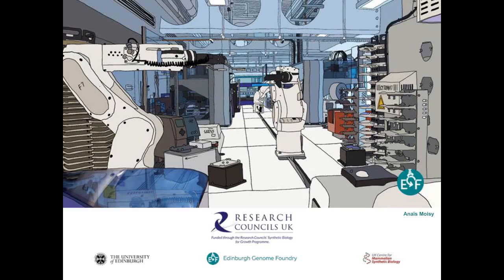Yeah, so that, again, it's a fairly variable number. The success rate for the Golden Gate assembly method that I described in the webinar starts off at about 90% for a small number of parts, around 6. And obviously, the greater the number of parts you have, the lower the success rate. That success rate drops to about 40-something% when you have a highly complex assembly, which is about 12, 20 parts. And the number of clones that we would have to pick is therefore inversely proportional to the success rate. So we would typically pick anywhere between 6 to 12 colonies per construct to be fairly confident that we would have at least one good one.